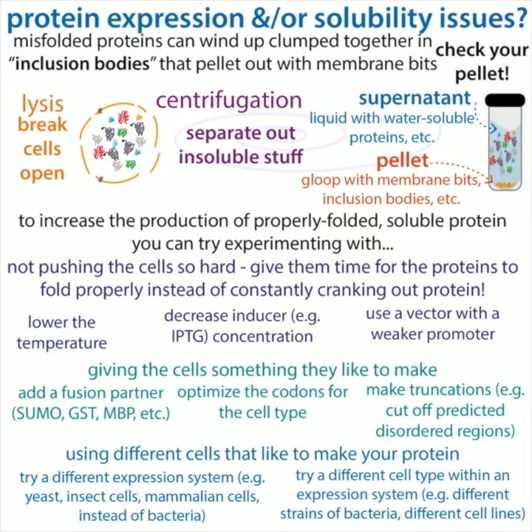You're going to have the most luck if your protein is small and doesn't have a lot of modifications like phosphorylation or glycosylation, the addition of sugar chains. Bacterial cells have the ability to read the genetic code, and they have the ribosomes to make the protein, but they don't have all the same machinery as our cells. So they don't have the ability to do all the same modifications in the same way. They can do some modifications, but they might do them differently.